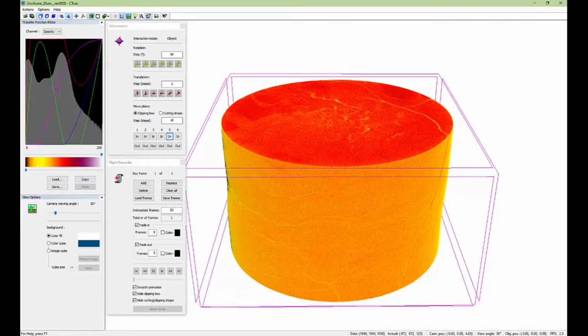Hello, and welcome to another installment of the Microphotonics Tip of the Month series. Today, we're going to be talking about how to export keyframes you've made in Flight Recorder when animating a dataset into a storyboard file. This storyboard file can be quickly applied to additional samples within the same project in order to let you duplicate your videos and settings for multiple samples within a project.